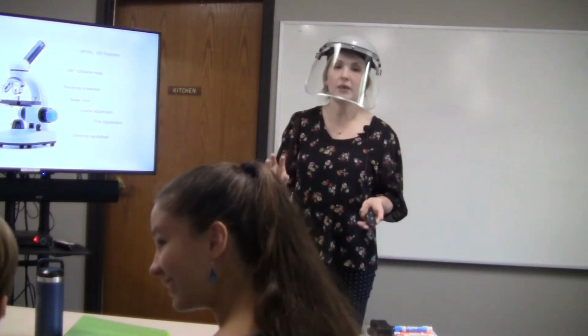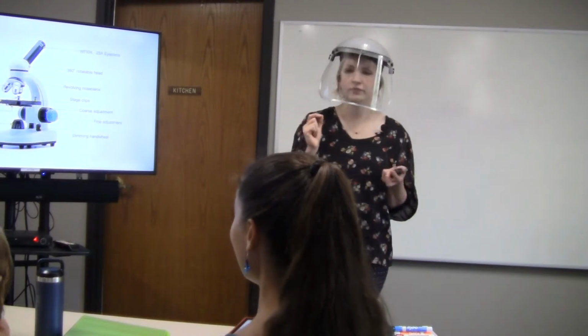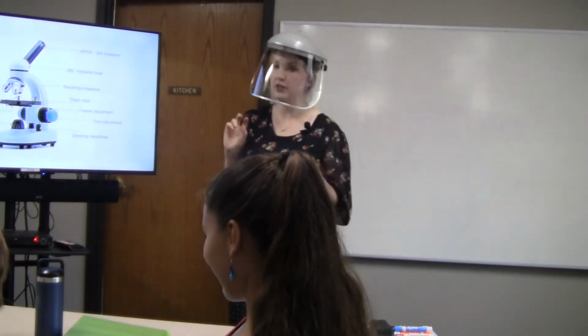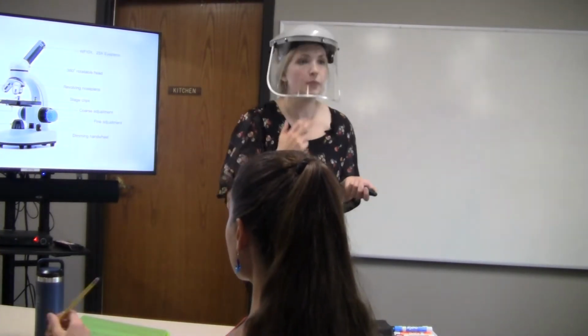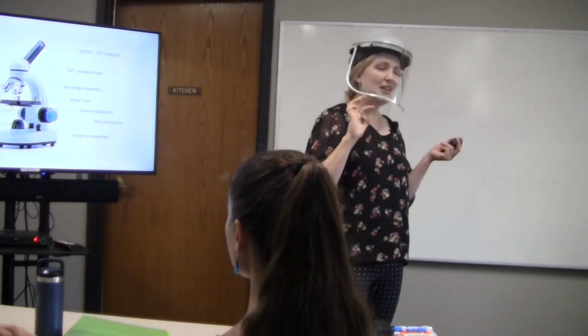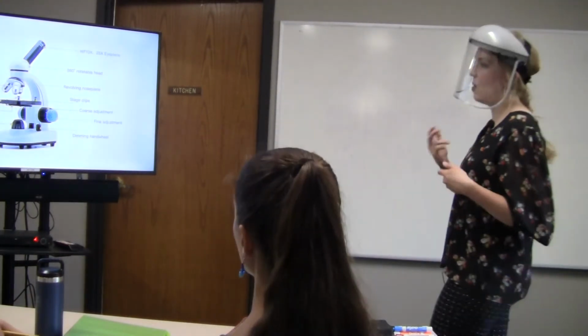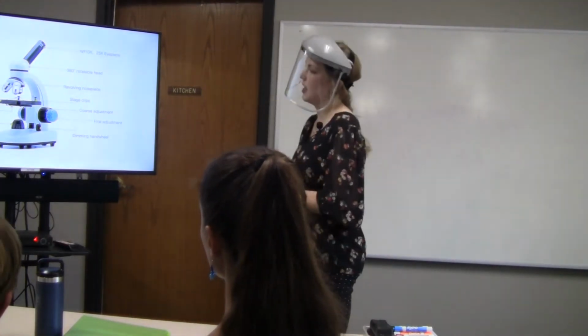So our microscopes have a 4 times, 10 times, and 40 times magnification. So 4 times being the least, 40 times being the most. You're always going to be able to see something with the 4 times. Depending on what it is that you're looking at, sometimes you won't be able to really make anything out with the 40 times lens, but you'll be checking it each time.